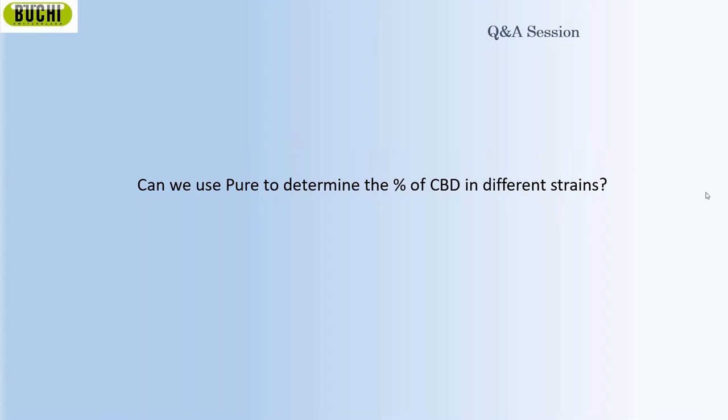But what you can do is create different calibrations for the ProxiMate, or if you have similar results, let's say strain A and strain B. If strain A has 20% CBD and strain B has 16% CBD, you can create a calibration from 15 to 25%.